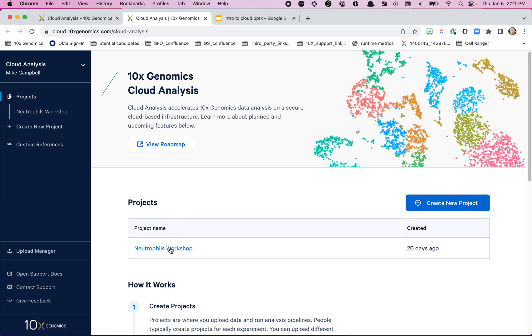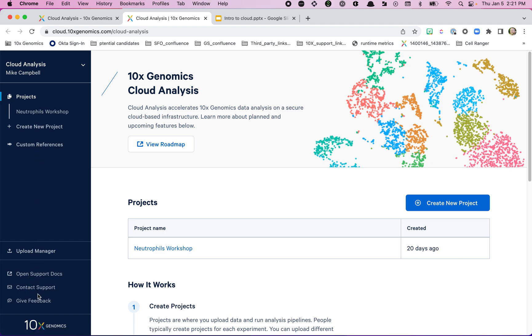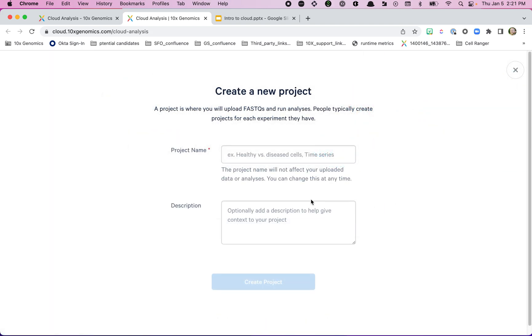This pre-baked data is here just to speed things along in our workshop. The interface is pretty intuitive: on the left-hand side you'll have your username, it'll say Cloud Analysis, you've got your projects and a few other useful links. Most things center around projects in Cloud, so we're going to create a new project now.